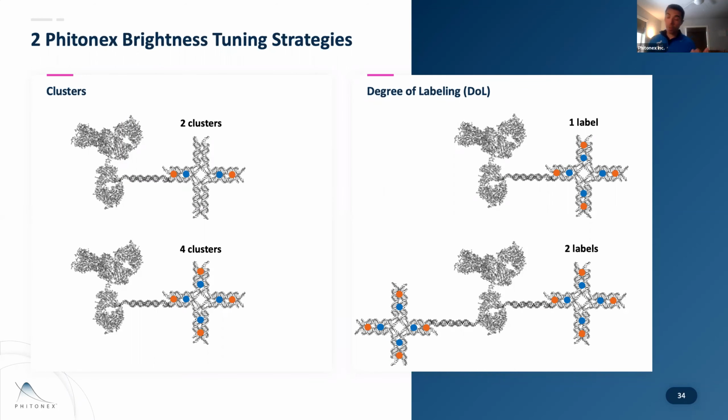So what does that look like? The steps are, you've got this antibody here. You see there's an activation step. What you do is you activate the NHS esters on here that are sitting on lysine, so very standard NHS ester chemistry. There's no special chemistry that we're using in there. Then we use this partner's kit to take a single-stranded oligo and put it onto the Fc region. And I say onto the Fc region because they've tested thousands of different antibodies and have never seen it mess up the ability of antibodies to bind.